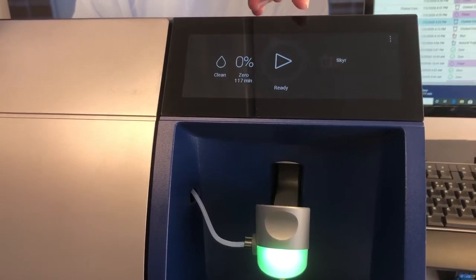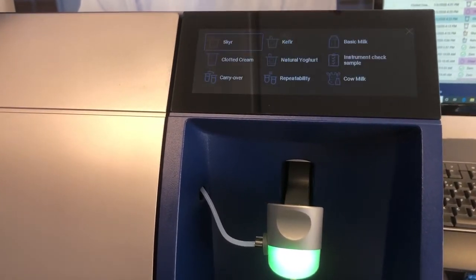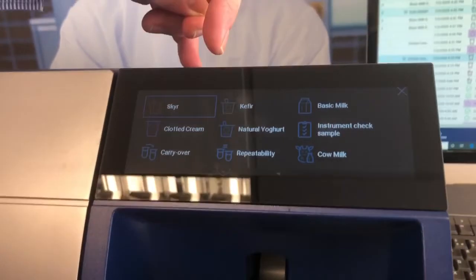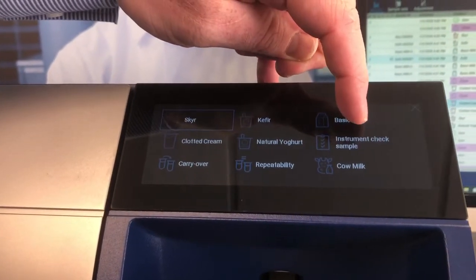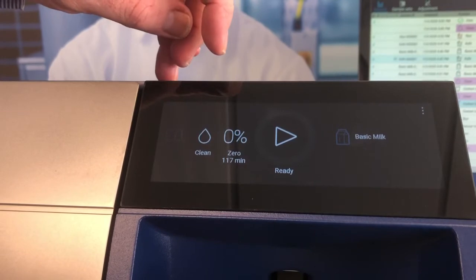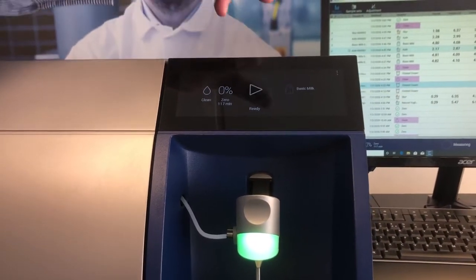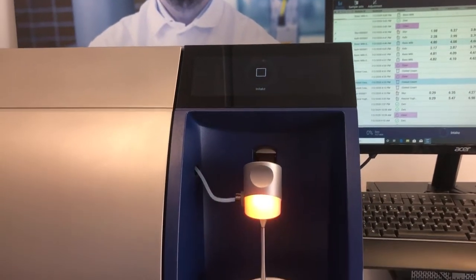We now have a new touch screen with a product selection button. This will show the last nine used products. We've got basic milk to analyse this sample. We've selected the product and now press the play button and it will analyse the sample.